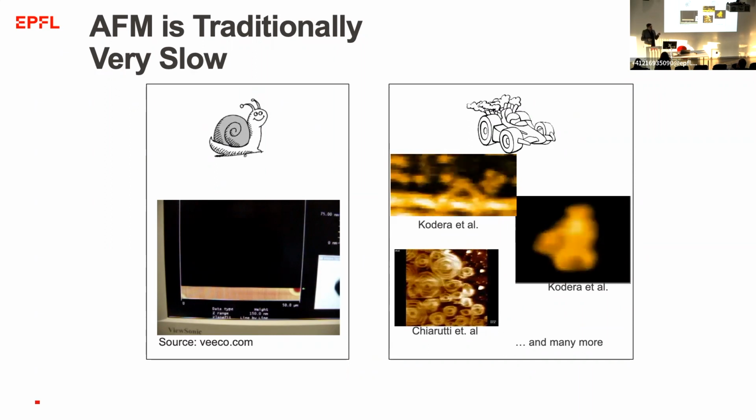And here I want to take a small detour towards something that's very dear to my heart, and that is to show that in order to get images of techniques that are not straight out of the catalog, you have to develop a lot of instrumentation.